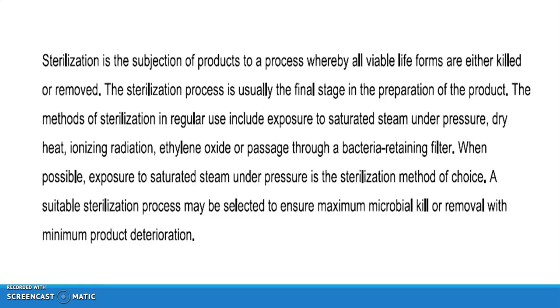Sterilization is the subjection of a product to a process whereby all viable life forms are either killed or removed. The sterilization process is usually the final stage in the preparation of a product. The methods of sterilization in regular use include exposure to saturated steam under pressure, dry heat, ionizing radiation, ethylene oxide, or passage through a bacteria-retaining filter. When possible, exposure to steam under pressure is the sterilization method of choice. A suitable sterilization process may be selected to ensure maximum microbial kill or removal with minimum product deterioration.